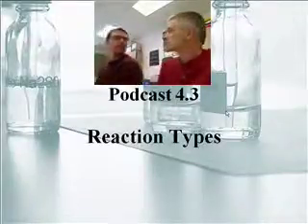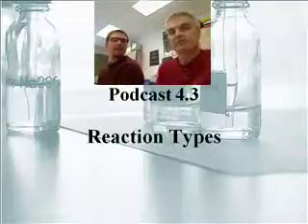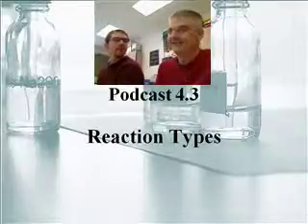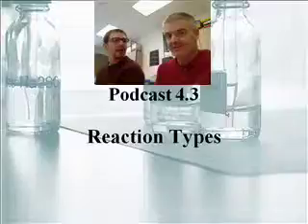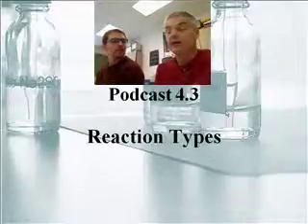Well, Mr. Sams, let's just start this right away. There's lots of cool demos. That's right. This is why you take chemistry. This is so cool. This is one of my favorite lessons because we get to burn things. We do. This is what everyone thinks of when they think about chemistry: all the chemical reactions. So hey, let's go.